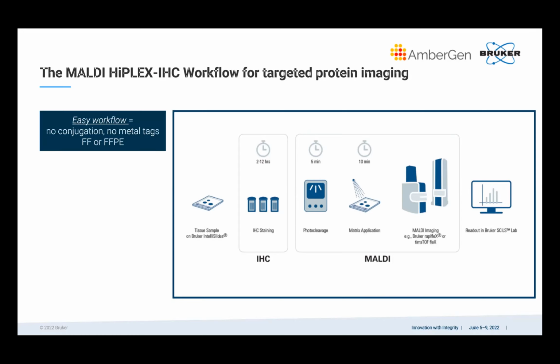The reason that I'm promoting this workflow to you is there's no conjugation here. The antibodies that you'll use for targeting your proteins of interest are not something that you have to do any additional wet chemistry on in your lab.